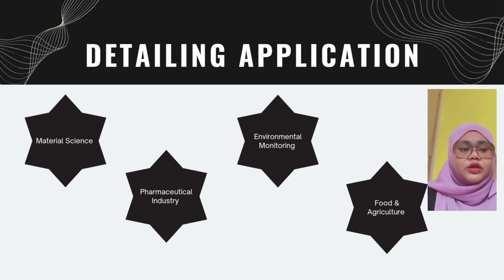Next, the pharmaceutical industry. For drug development, FTIR is used to identify active pharmaceutical ingredients and excipients in drug formulations. Next, environmental monitoring, air quality analysis. FTIR can detect and quantify pollutants like carbon dioxide, methane, and other greenhouse gases in the atmosphere.